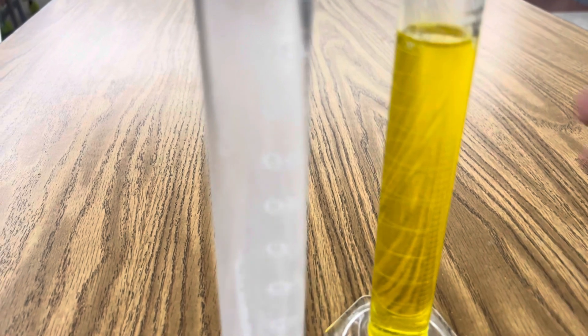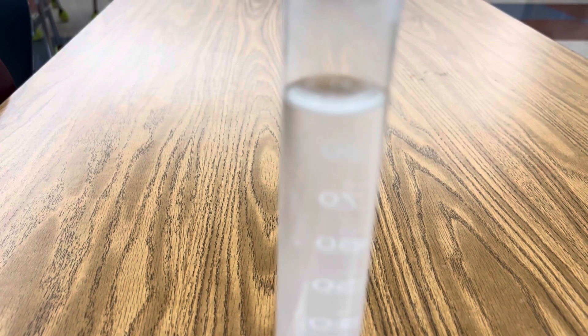Once both of your reactants are completely dissolved, you're ready to combine the two. As you pour one into the other, immediately you see a bright yellow precipitate. Watch this. Look at that — that precipitate that's insoluble is lead chromate. You can see how thick it is. I'm going to add a little more. Just amazing. Here you can see the precipitate falling out of the solution.